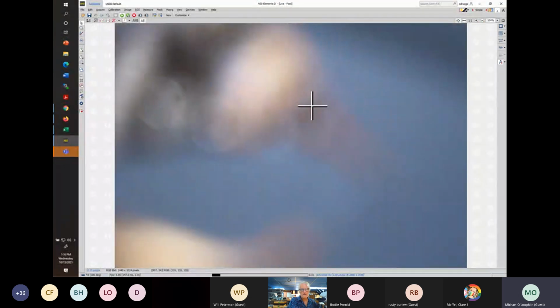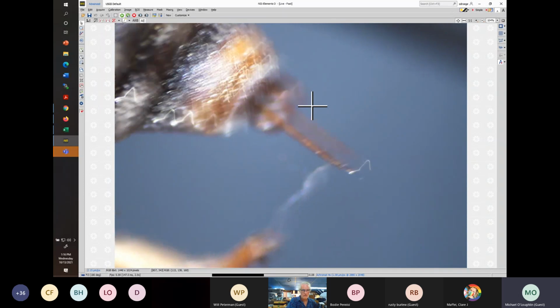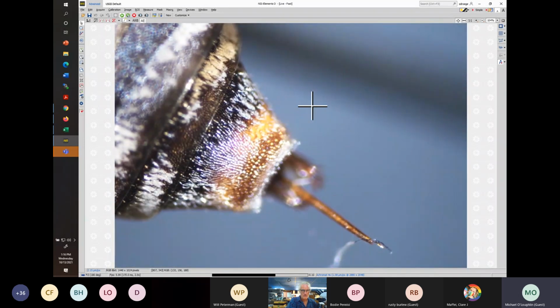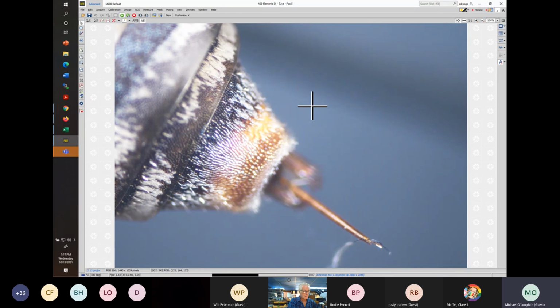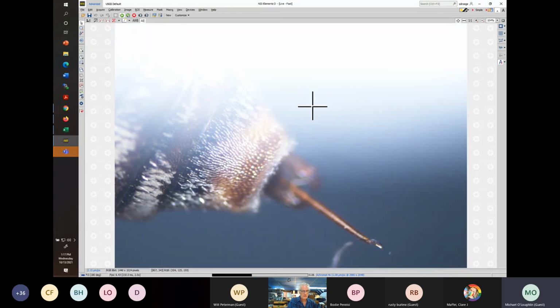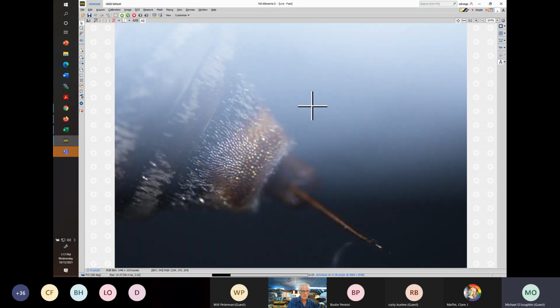And in Triepeolus, the length and the width, this is not a very awesome specimen. Try the velum thing. Yeah, let me find my little piece of velum here and flake this in. So we're getting a lot of reflecting going on, but the pseudopygidial area is defined. You can see the silvery hairs.